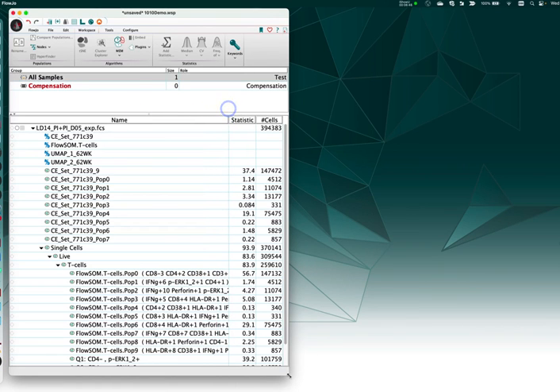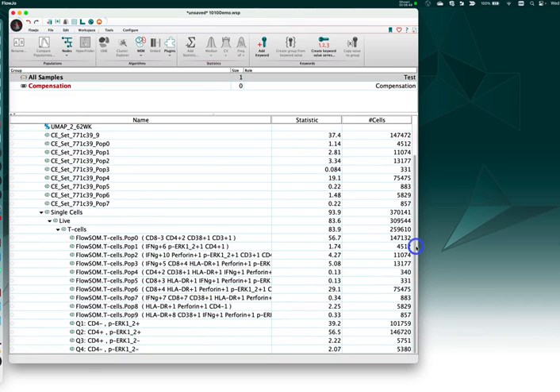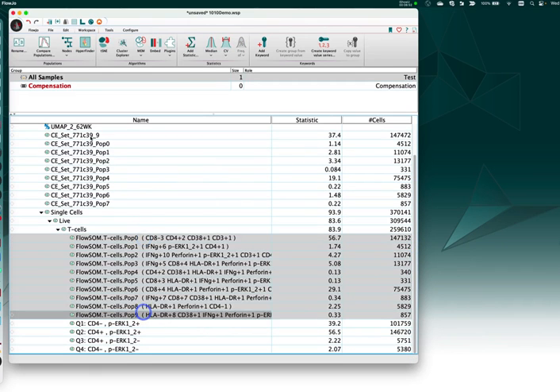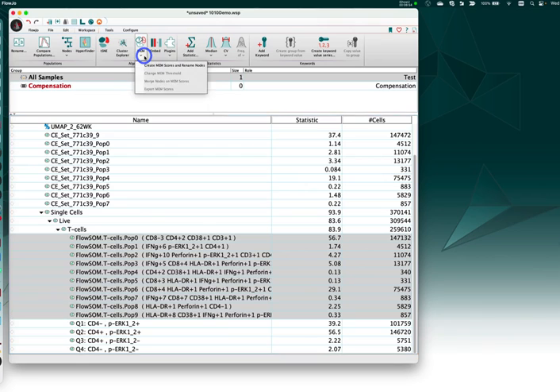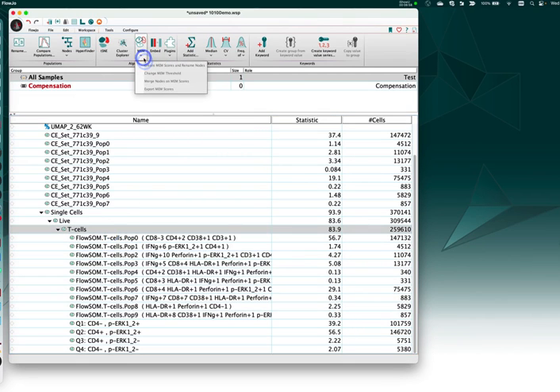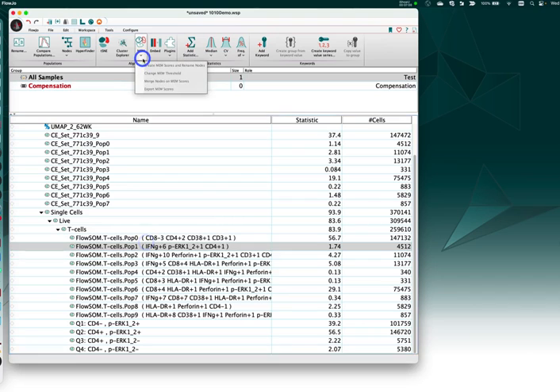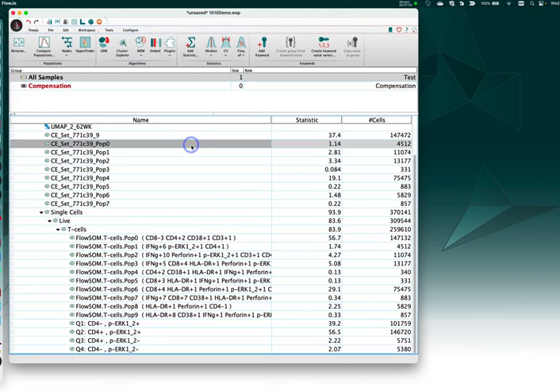I will point out that I've already gone through and applied MEM scores to these clusters. And one new option that's built in here is that I could go into MEM and choose to export the MEM scores as a CSV file. So if you wanted to get those out in some kind of editable document, no problem.